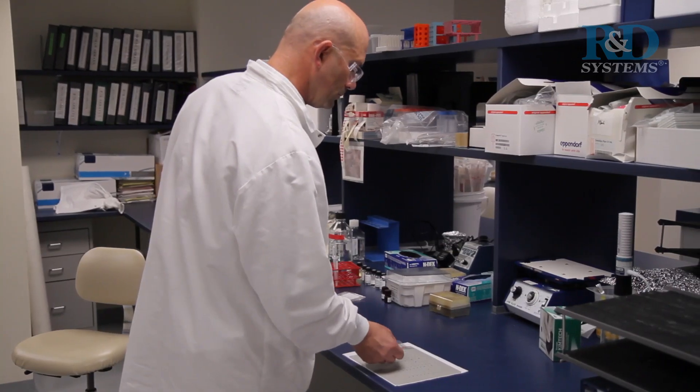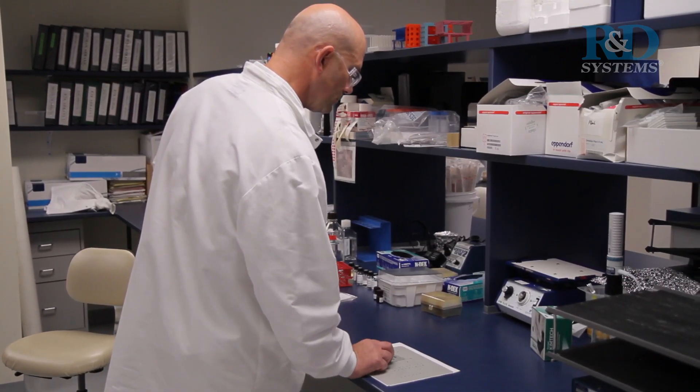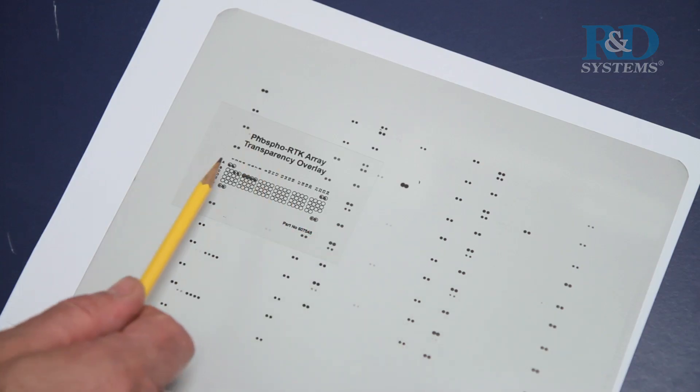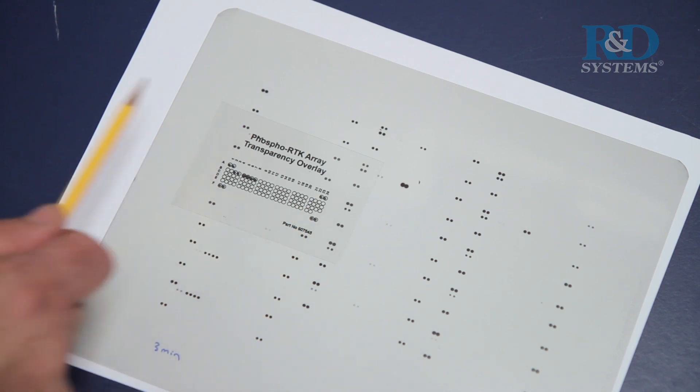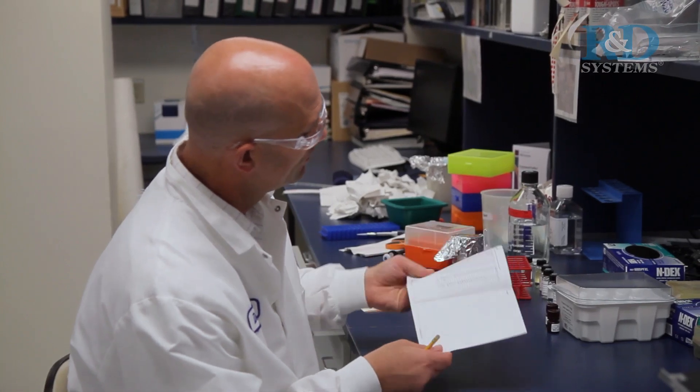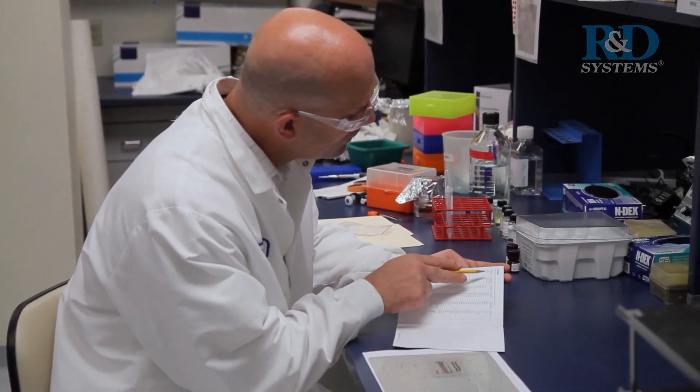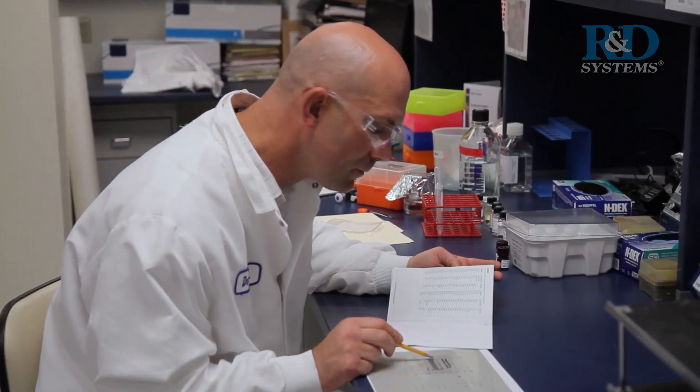Positive signals seen on developed film can be quickly identified by placing the transparency overlay on the array image and aligning it with pairs of reference spots printed in the corners for this purpose. The location of controls and capture antibodies is listed in the appendix of the Human Phospho RTK array data sheet.